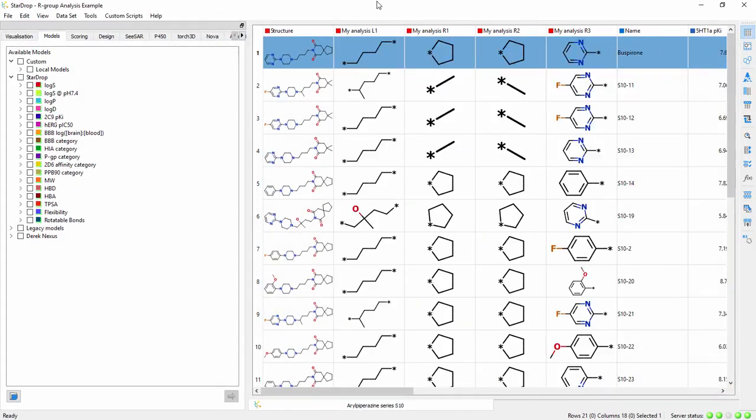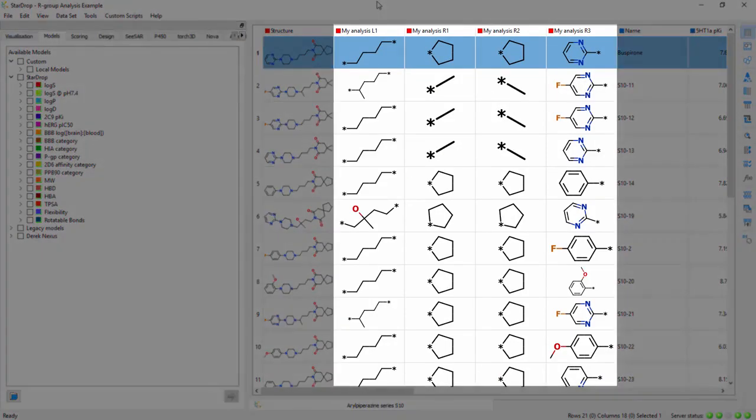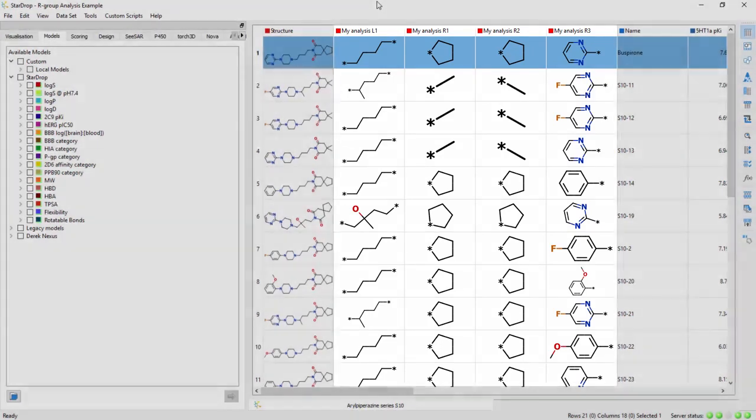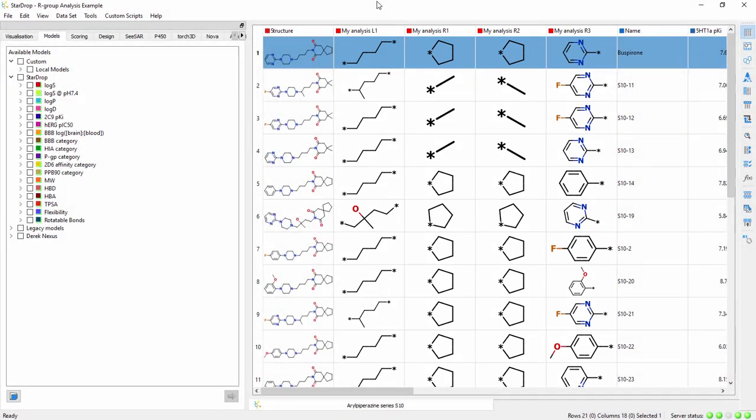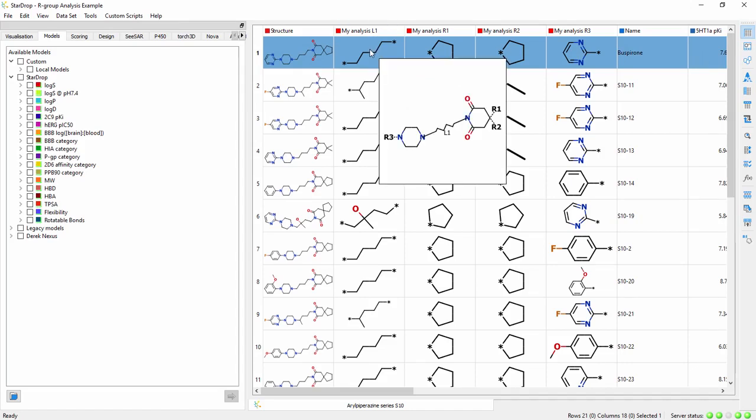And when complete, a column is added to the dataset for each R-group, linker, or variable atom. If you'd like a reminder of the template used to perform the analysis, just point at a fragment and a pop-up will appear.